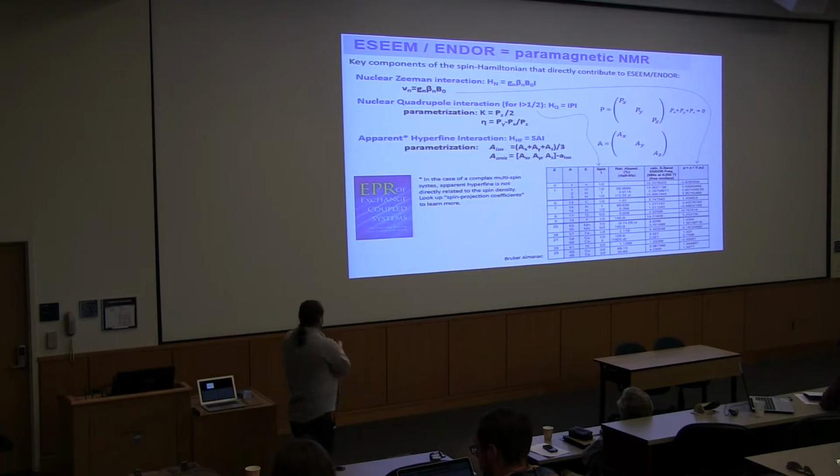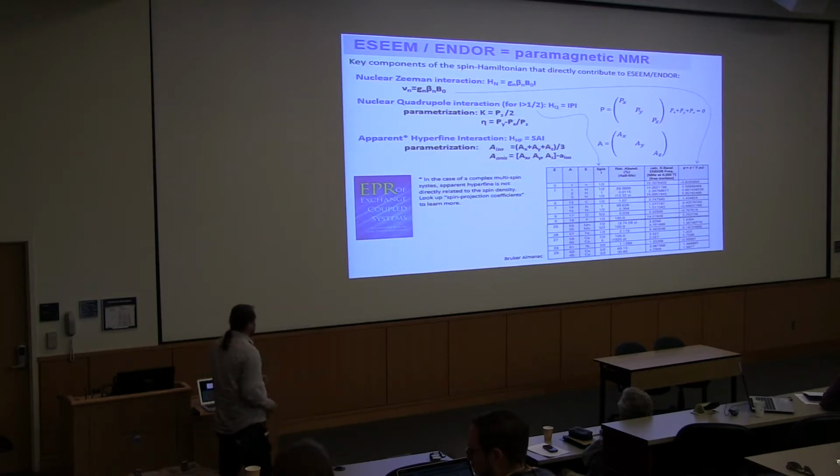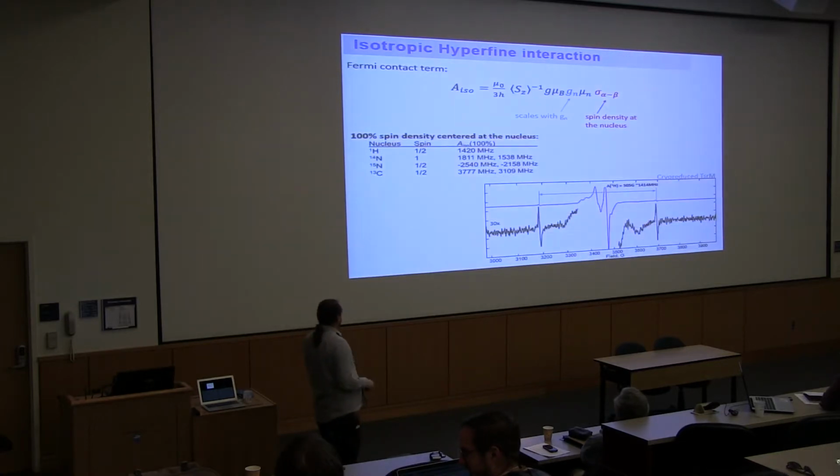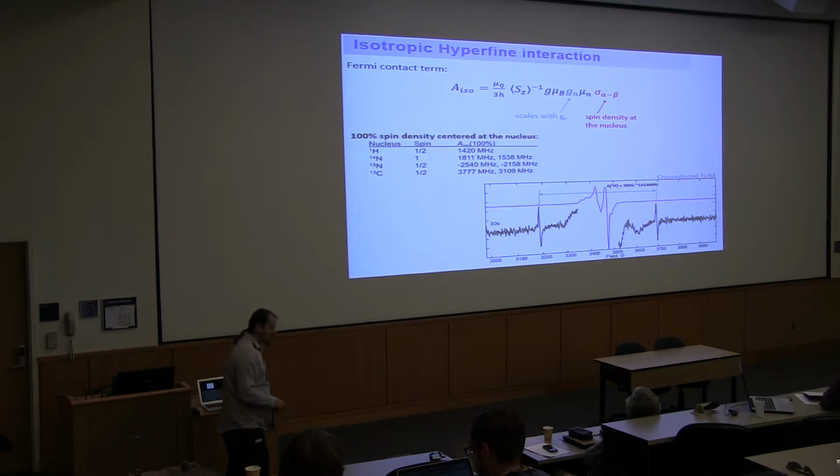This is something I'm not going to talk much about, but here's a really good book, EPR of Exchange Coupled Systems, that describes it in detail. It's Bencini. Again, the resolution is really weird. All right, so let's start with isotropic hyperfine.